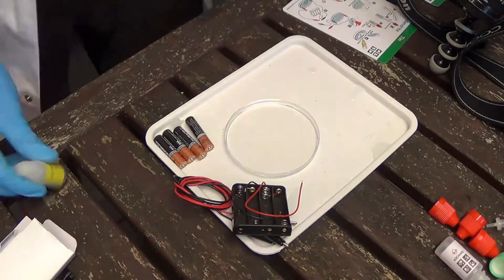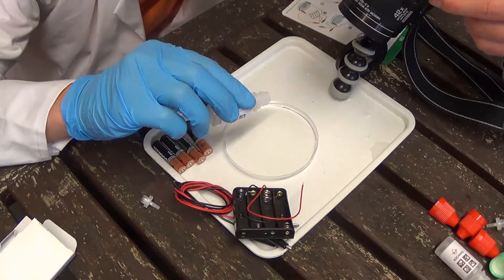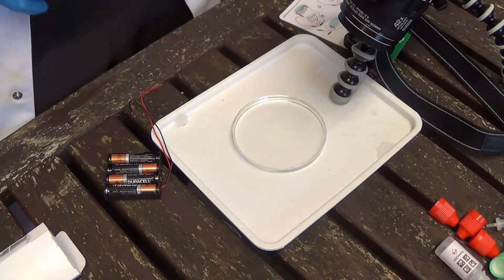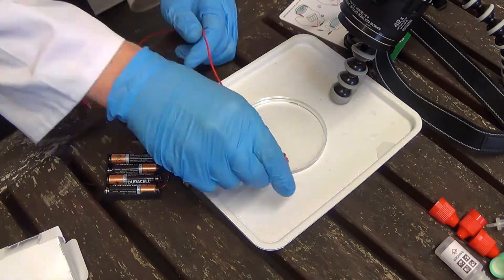The next step is to add a couple of drops of liquid soap. This will then help with the reaction later. Take your battery pack, insert the batteries which are not included, then attach the electrodes. Place on each side of the petri dish and then you're done.